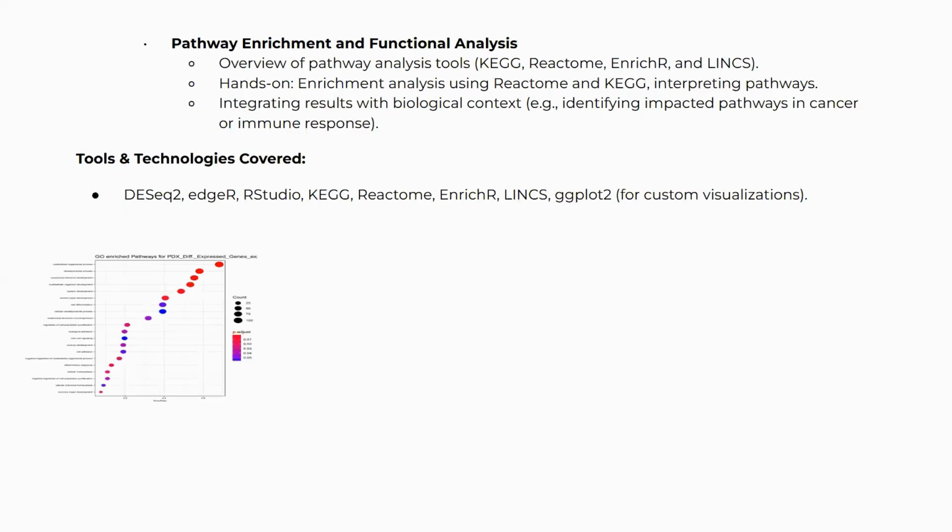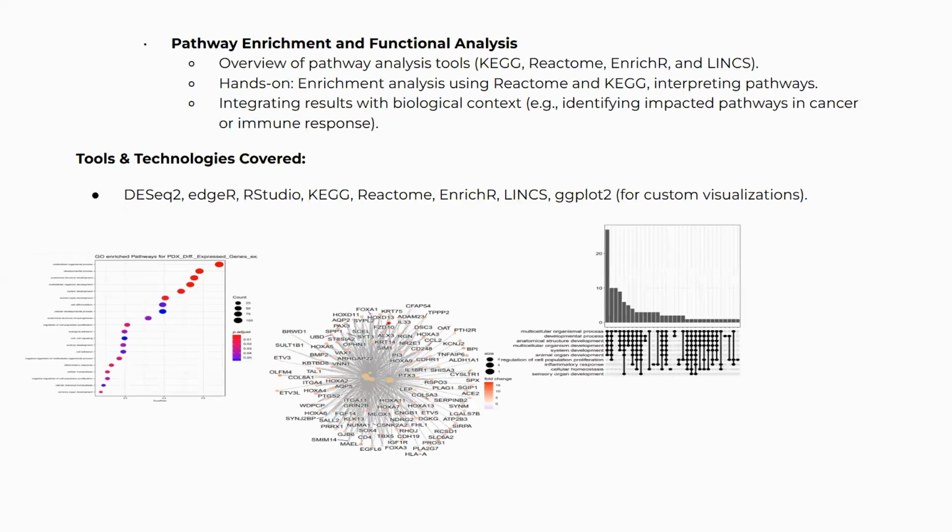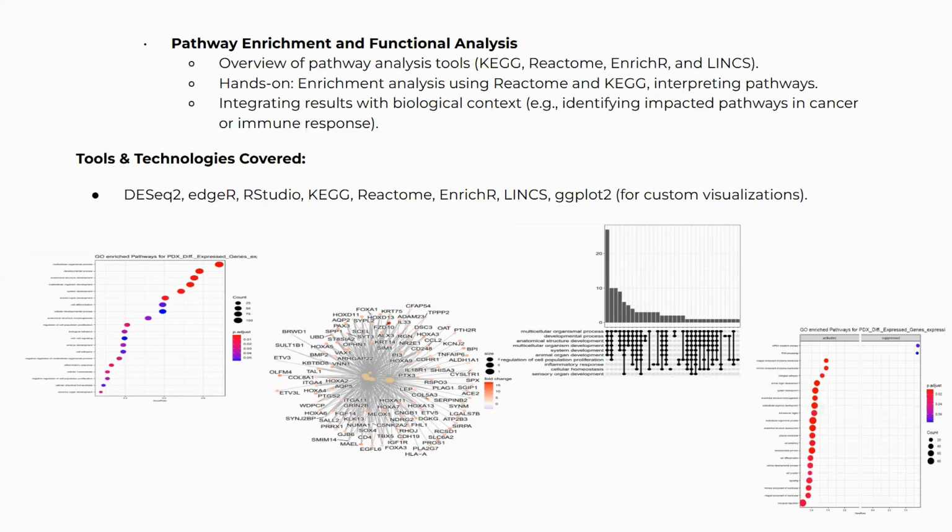And here we are going to prepare some plots also for the visualization of the results for the biological context here. Now, by the end of day two, you will be well versed in identifying differentially expressed genes and understanding their role in biological pathways.